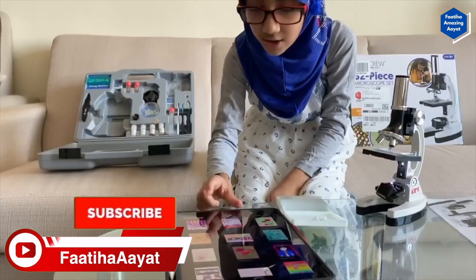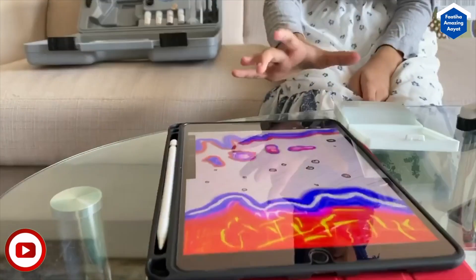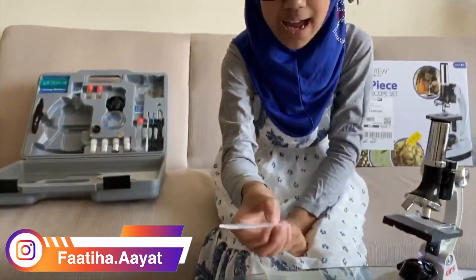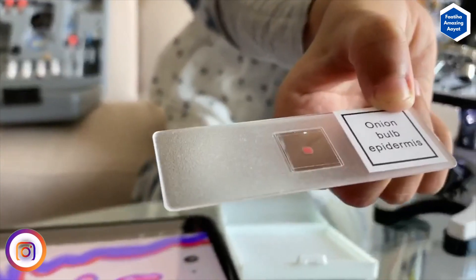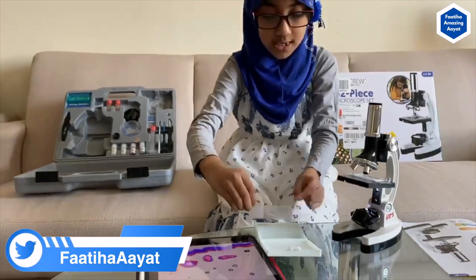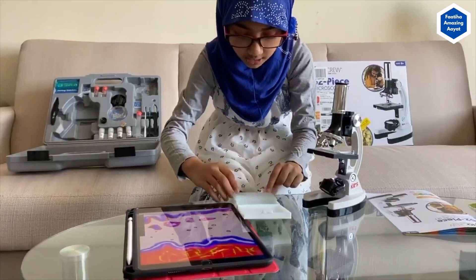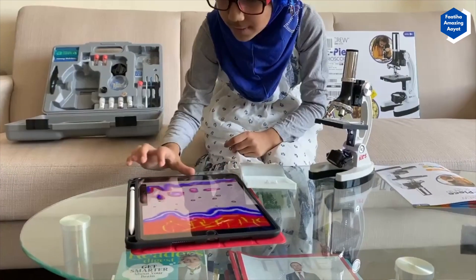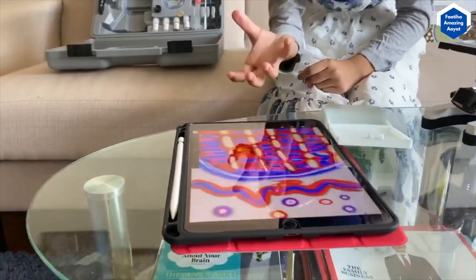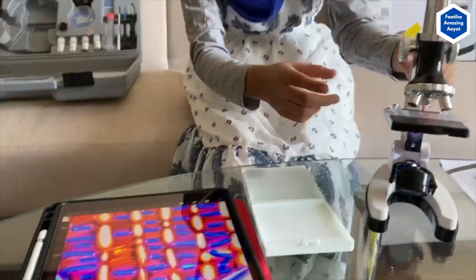There is also an onion bulb. This is what the onion bulb looks like when you look at it through the microscope, but here is the original onion bulb without a microscope — you're seeing it much longer. And now I'm going to show you something else: this is the goldfish scale. This is actually how the goldfish skin — the scales — look.